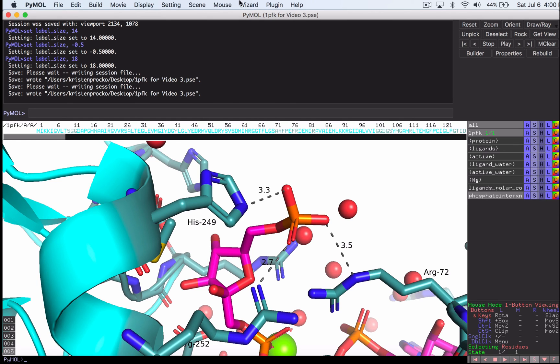Now I'm going to go back into edit mode. Command click and get these labels into a beautiful orientation for a publication quality image. And this little 2.7, I'm nervous. Okay, there we go. And we do want to show that it's that dash. Maybe right there. Not too bad. Okay.